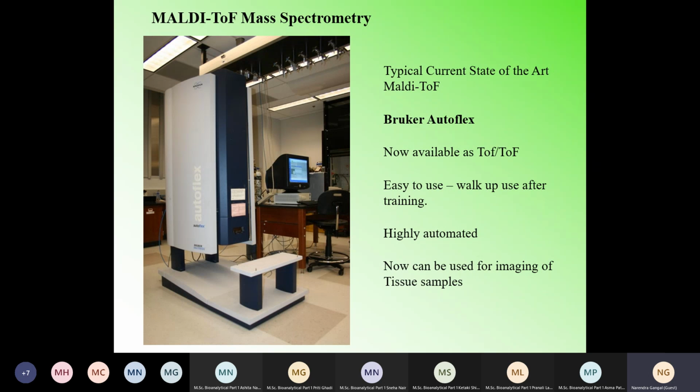Similarly, if I have to do some tissue analysis, in case of infrared microscopy, FTIR microscopy, I can take the sample and choose the smallest possible portion, and instead of going in the transmission mode, I can go into the reflection mode. If I do reflectance spectroscopy using infrared, I can use the microscopy, a typical infrared microscopy, whereby I can look at the smallest possible spot.